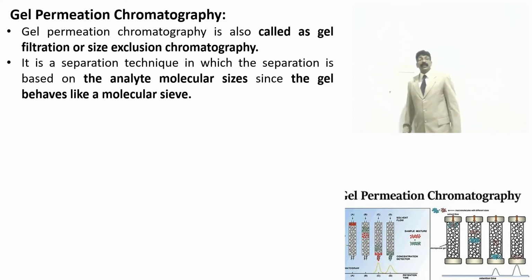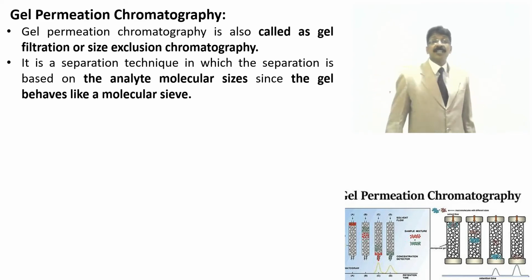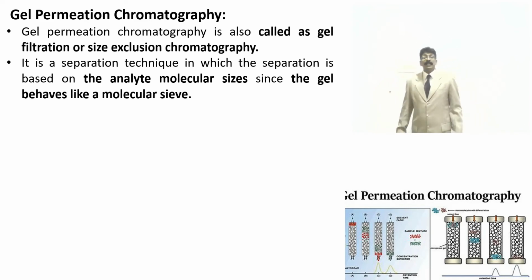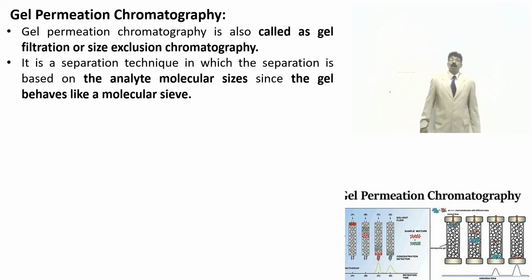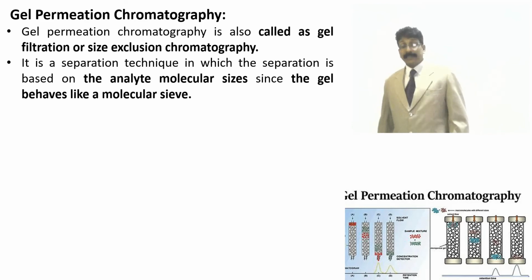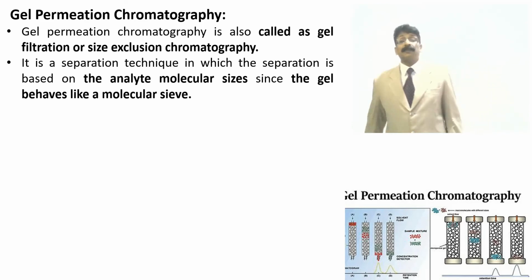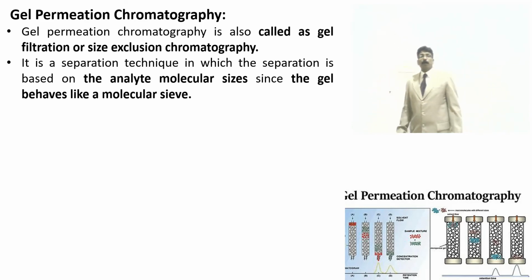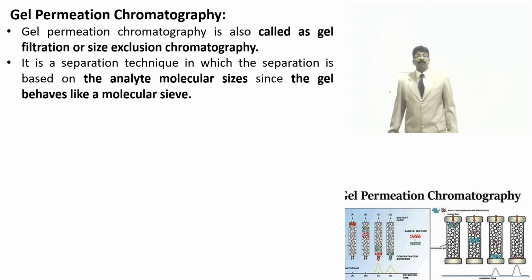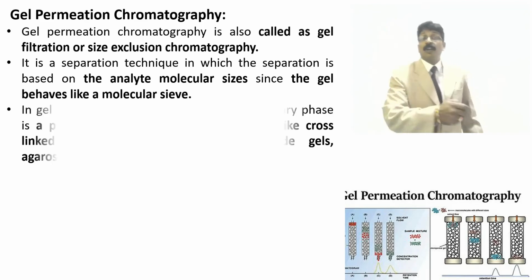It is a separation technique in which the separation is based on the analyte molecular size: the molecular size of the sample, of the protein, of the DNA, of the RNA, or of the compound which you have selected. The analyte molecule size plays a major role, since the gel behaves like a molecular sieve.